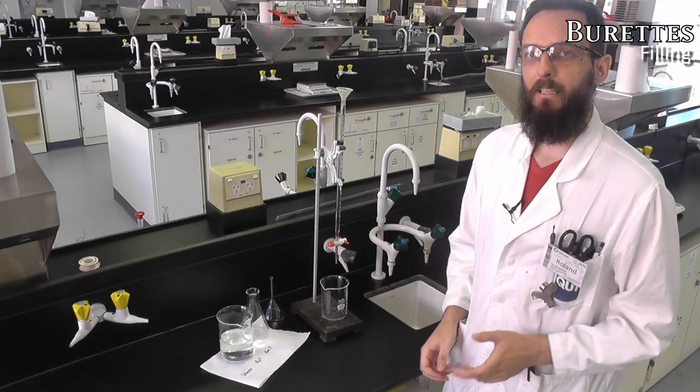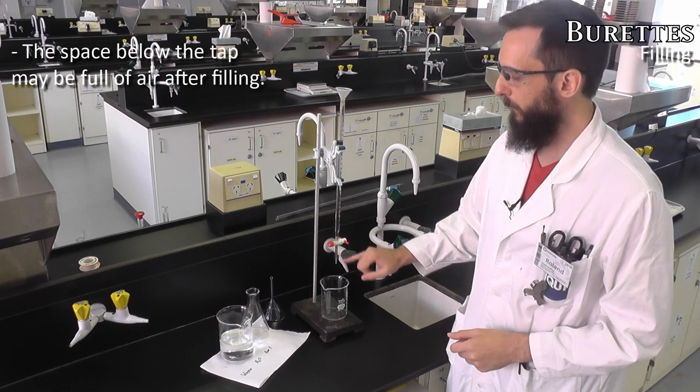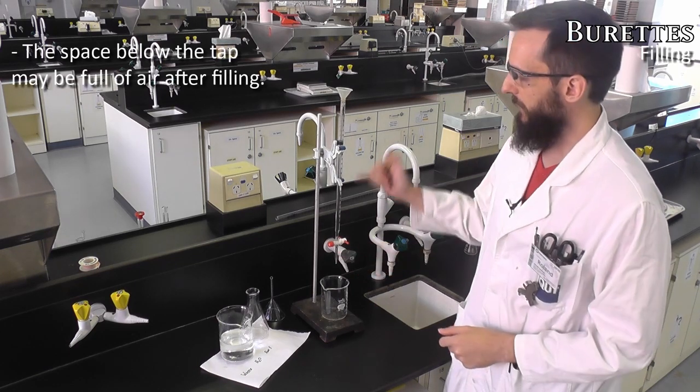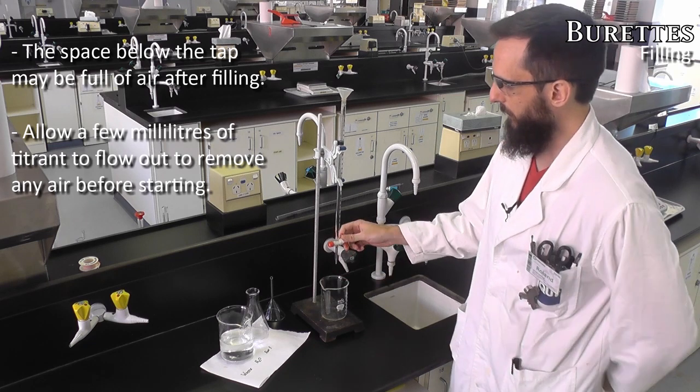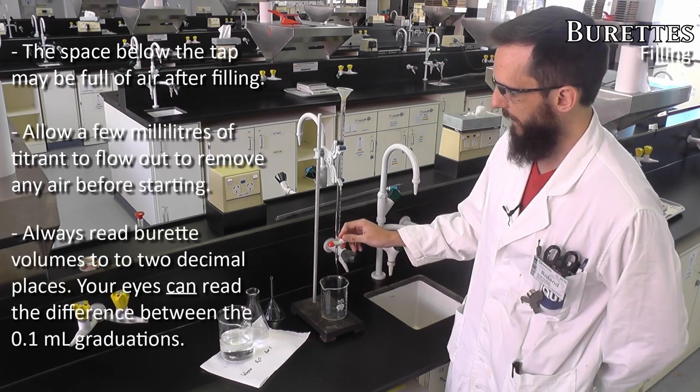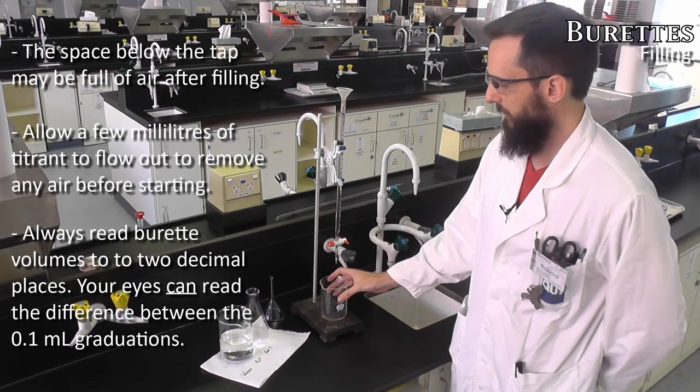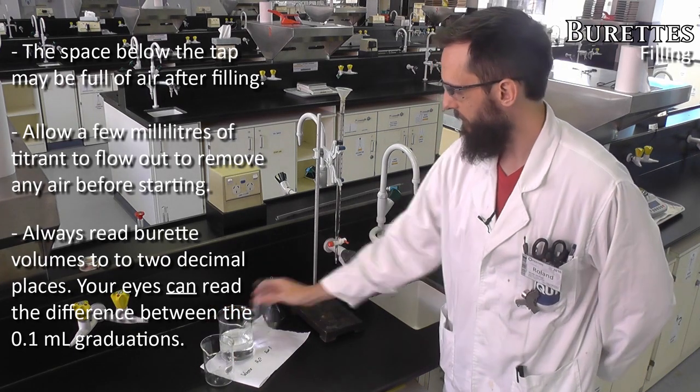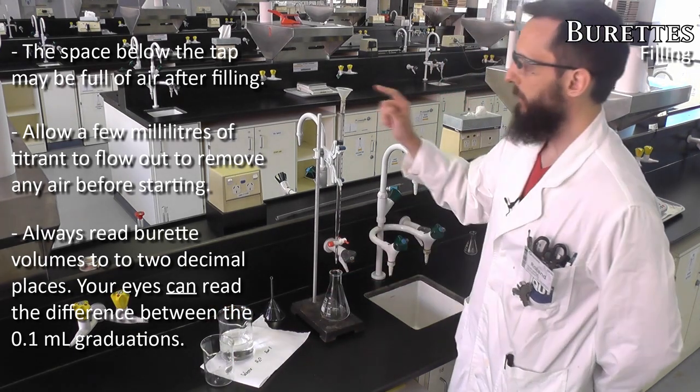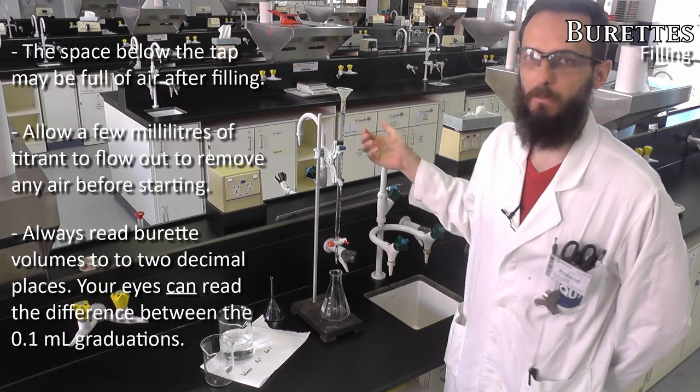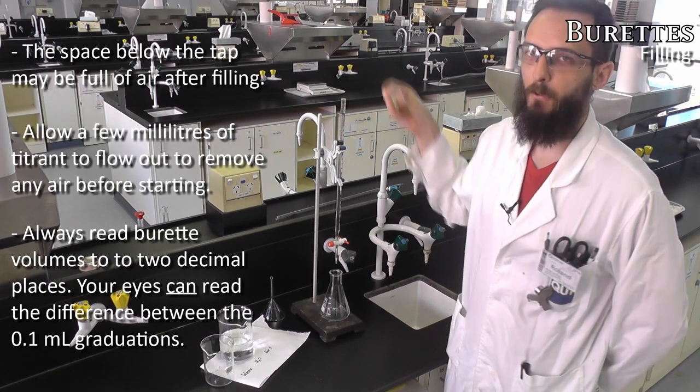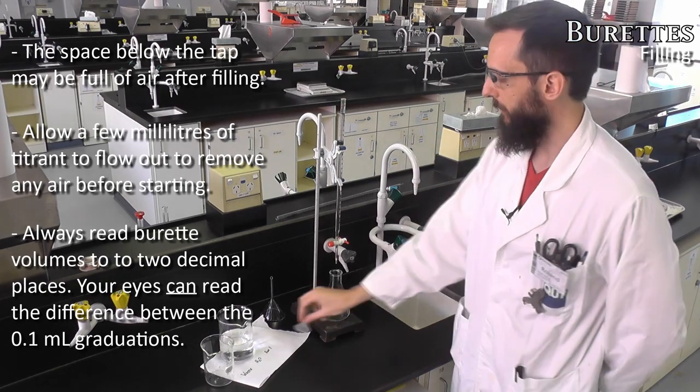Now before we start titrating it's important to note that there's a small void volume down here where the liquid has not yet gone because we had our tap closed. So with the waste beaker underneath just run that tap open for a few seconds until all the air bubbles leave. Then we can replace that with our reaction and always take out this funnel from the top because if it were to drip in any liquid during your titration it would be a volume of liquid you've not accounted for in your experiment.